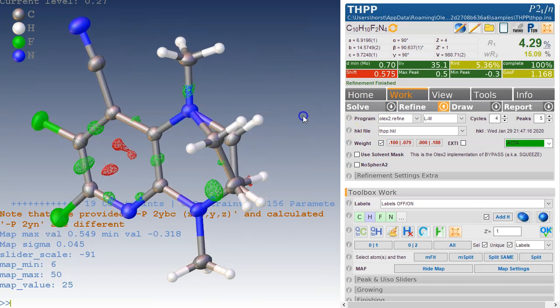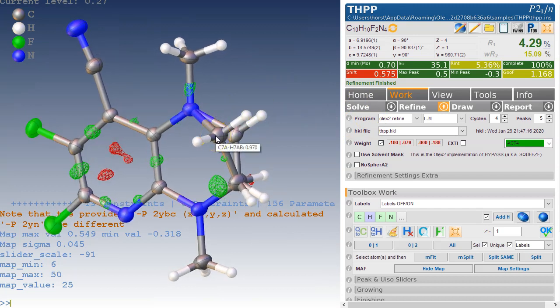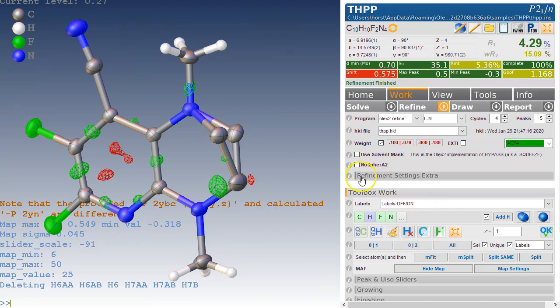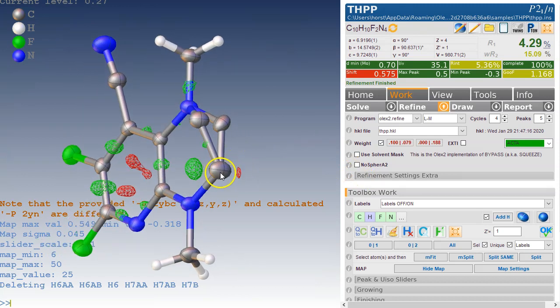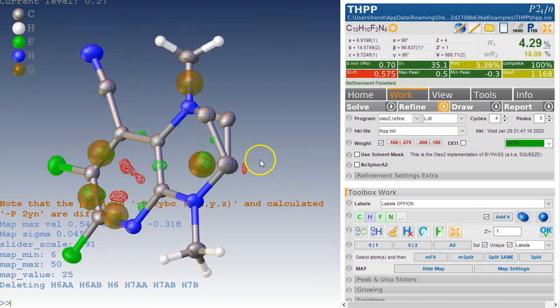First of all, because this disorder is involving carbons and also hydrogens and the occupancies here when we hover the mouse, we can see this is occupied, 83, 87, 88 percent. There's quite a lot of carbon, so 88 percent of a hydrogen is quite a lot compared to like 10 percent of a carbon, which is what this part would be here, 12 percent. So what we do, we press the left mouse and shift key and now we select this whole disordered area and we delete all the hydrogen atoms. So this is this button here, but it also could be kill $H that would delete the hydrogens. Now we basically want to split this atom or assign this Q peak as a carbon.